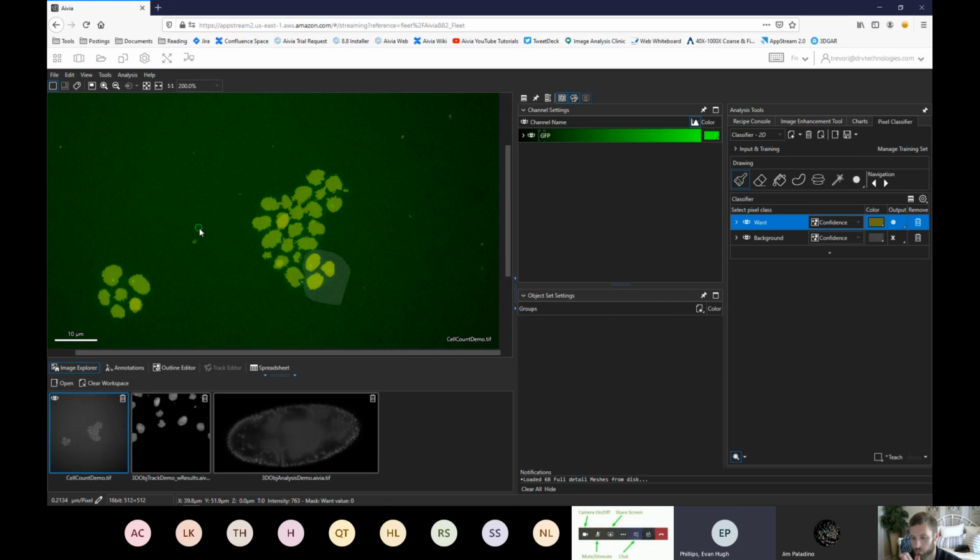Can you repeat that keyboard shortcut? Yep. You hold Control and Shift on your keyboard while scrolling the mouse wheel. If you're on a Mac, it might be Command Shift, or the Command button might just not be mapped correctly into AppStream.